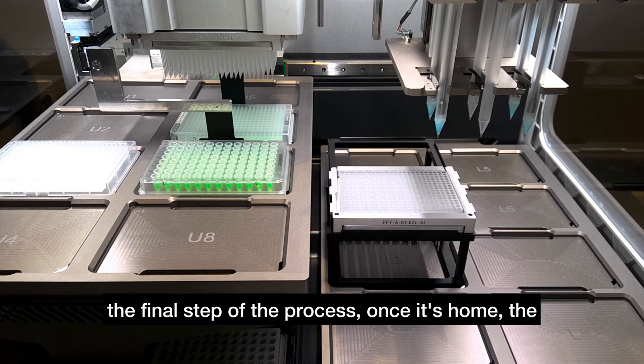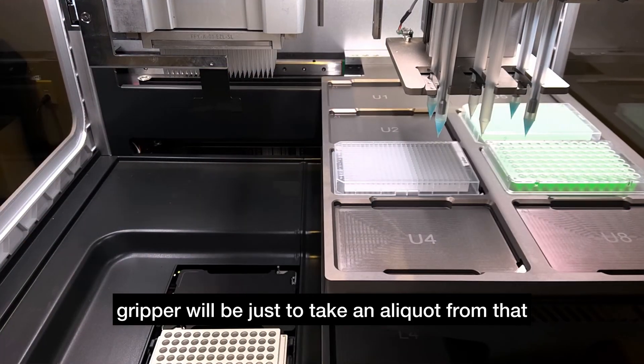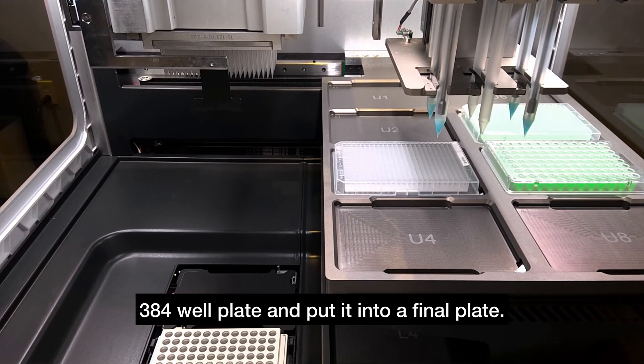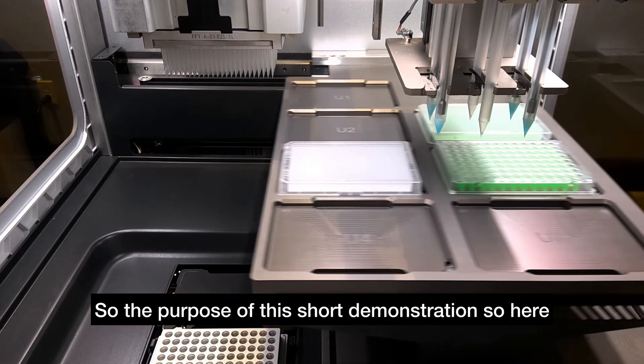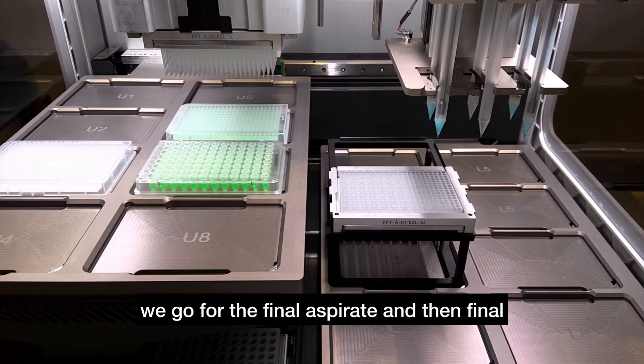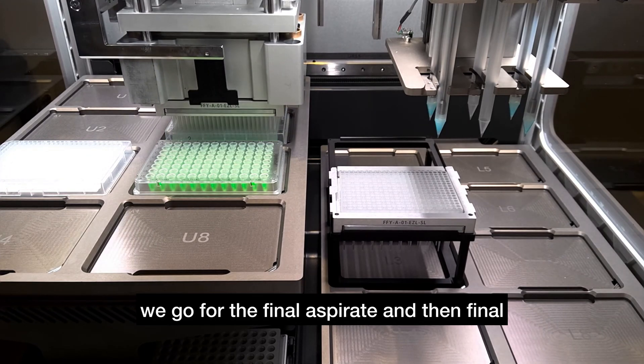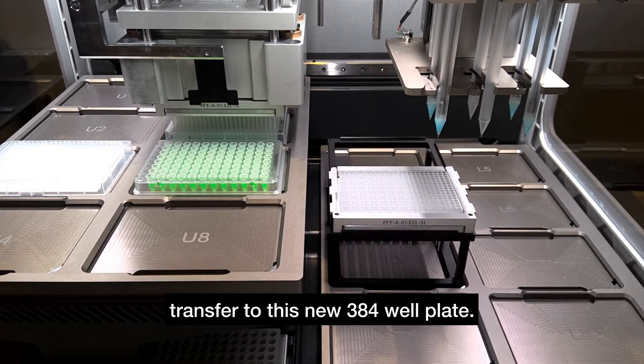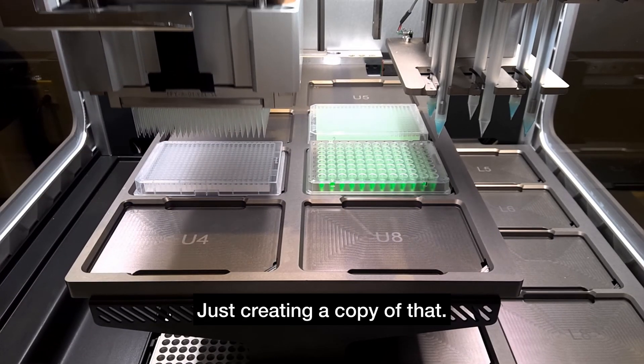The final step of the process, once it's home, will be to take an aliquot from that 384 well plate and put it into a final plate. Here we go for the final aspirate and then final transfer to this new 384 well plate, just creating a copy of that.